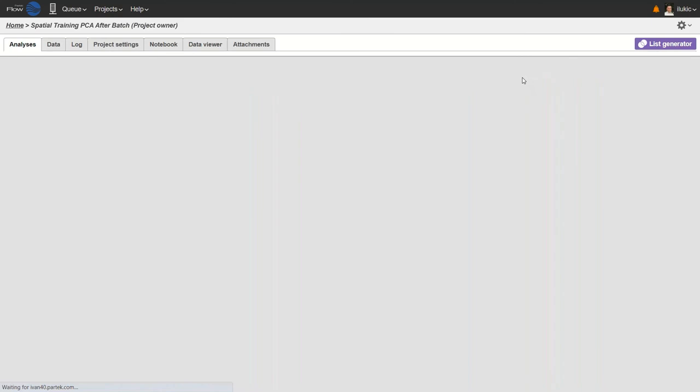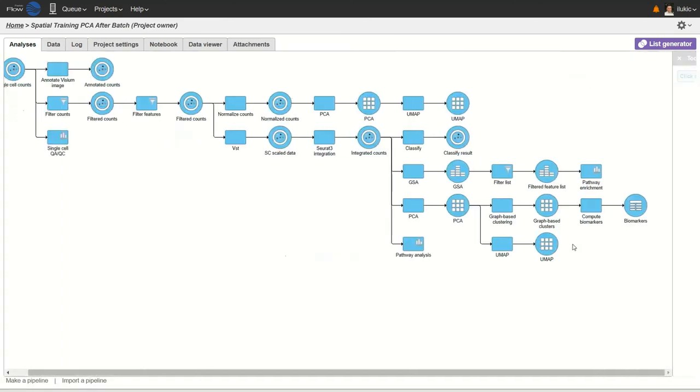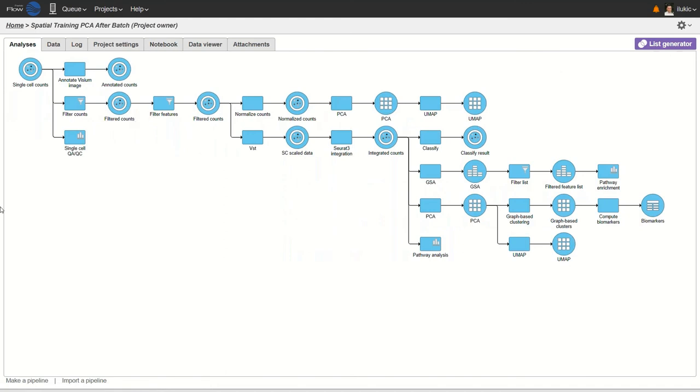Going back to the pipeline, I told you that pathway analysis was my final step. Therefore, I would just like to summarize. I've shown you how to import spatial transcriptomics data. After that, I performed some filtering, some data processing. The next step was exploratory analysis.